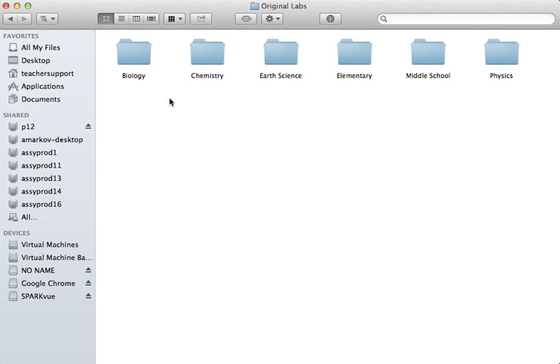If your students won't be accessing these labs and you didn't want them to be within that folder, you can place only the labs that you wish within this folder.